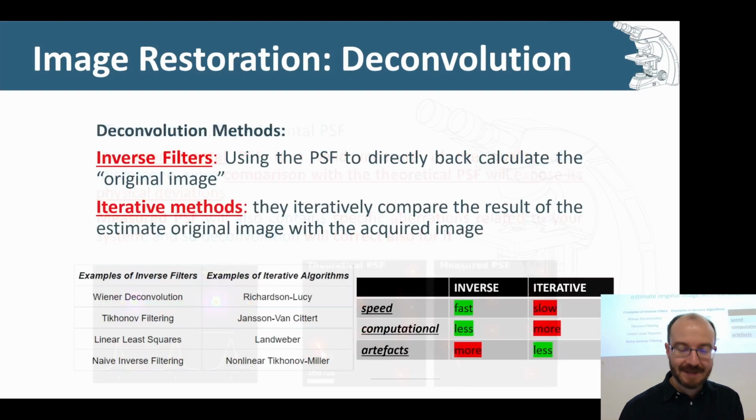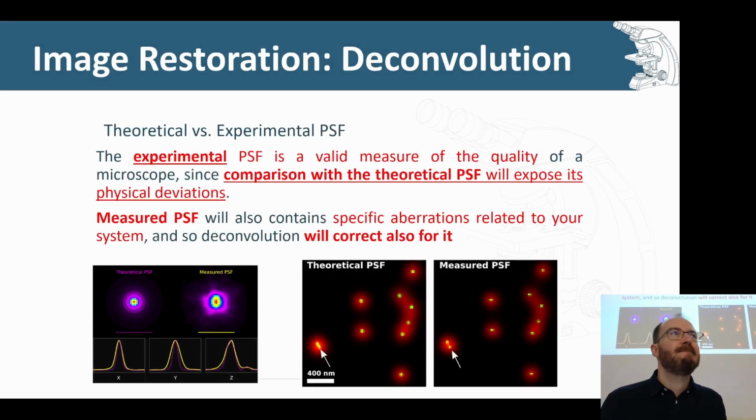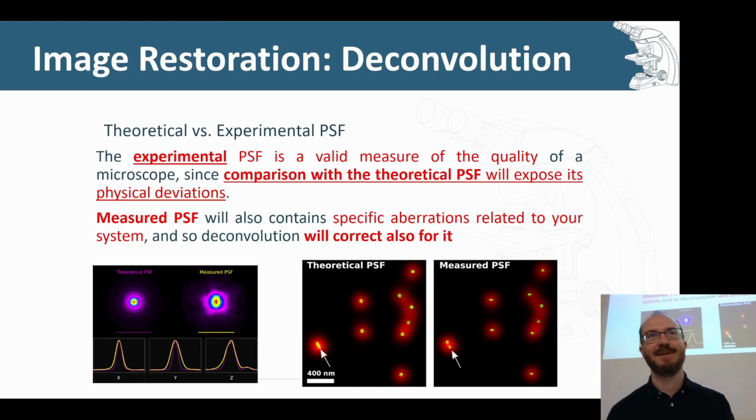Yeah. We're using the bead slides, they could have very different intensity than the actual sample. Does that affect the accuracy as well? Not so much the relative intensity, no. It's more just the distortion or the blurring that you actually want to model. Yeah. But you should use the right objective for the right oil, with the right emission. Yes, exact same conditions as the actual sample you're going to image.